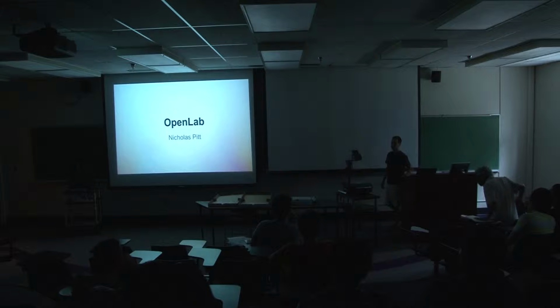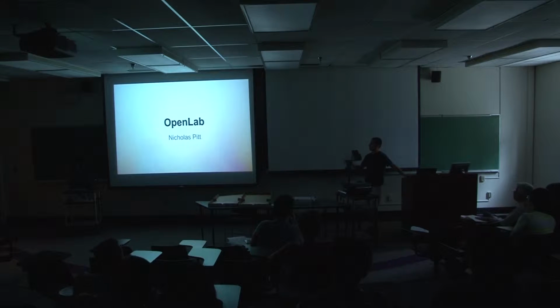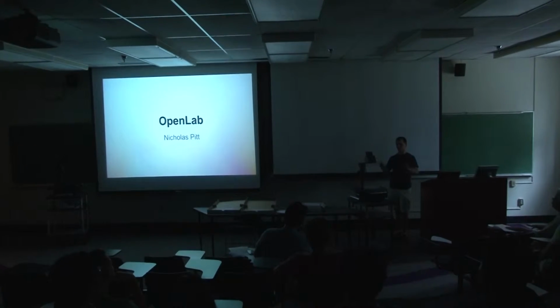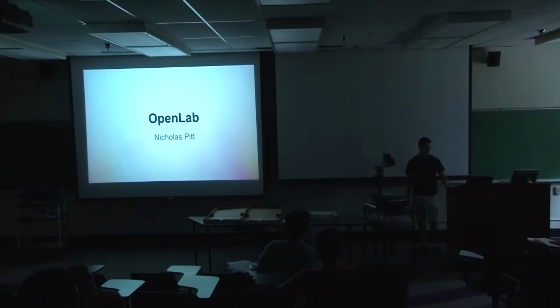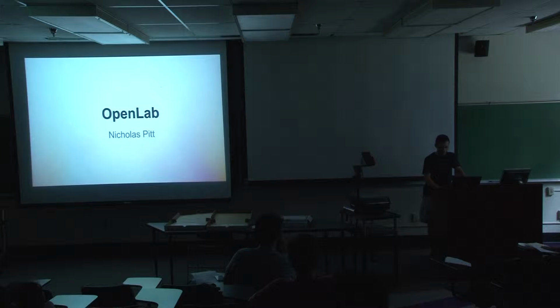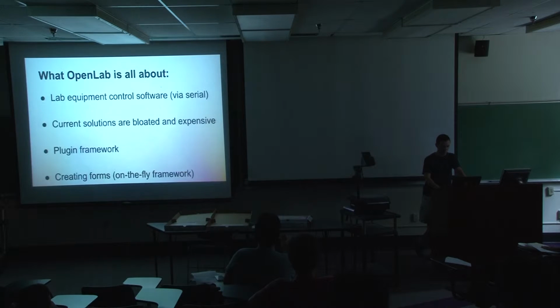Right, my name is Nicholas Pitt, and I've been working on OpenLab. It was an idea I came up with last semester after needing a graphical user interface for serial lab equipment, and not having a copy of LabVIEW, which is pretty darn expensive. So yeah, it's all about LabVIEW-style control software.